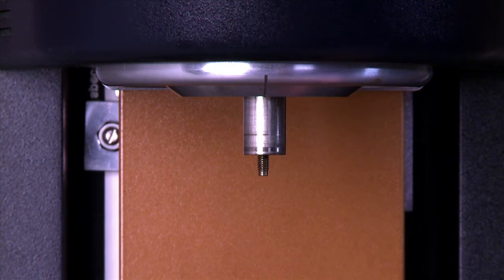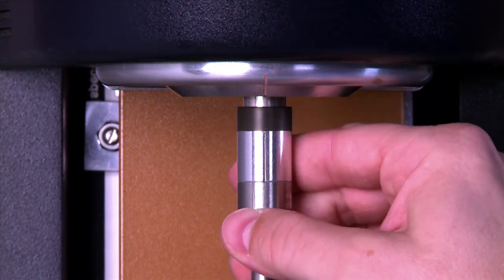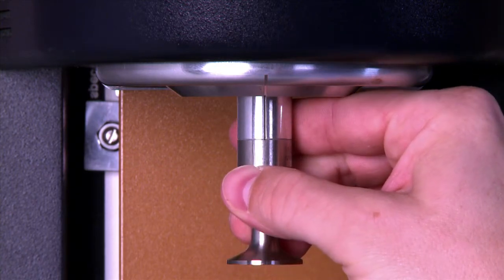Now insert the geometry, making sure to align the engraved line on the geometry with that of the rheometer head.